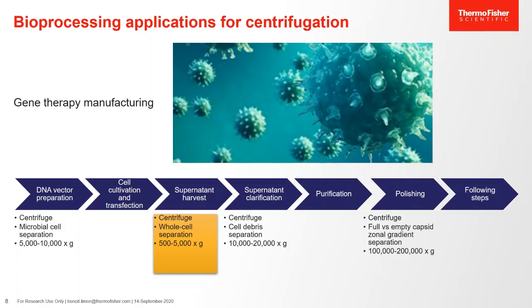And then the centrifuge can also be used to clarify the supernatant, requiring a little bit more G-force, and then it can also be used for the final polish, requiring an ultra-speed centrifuge.